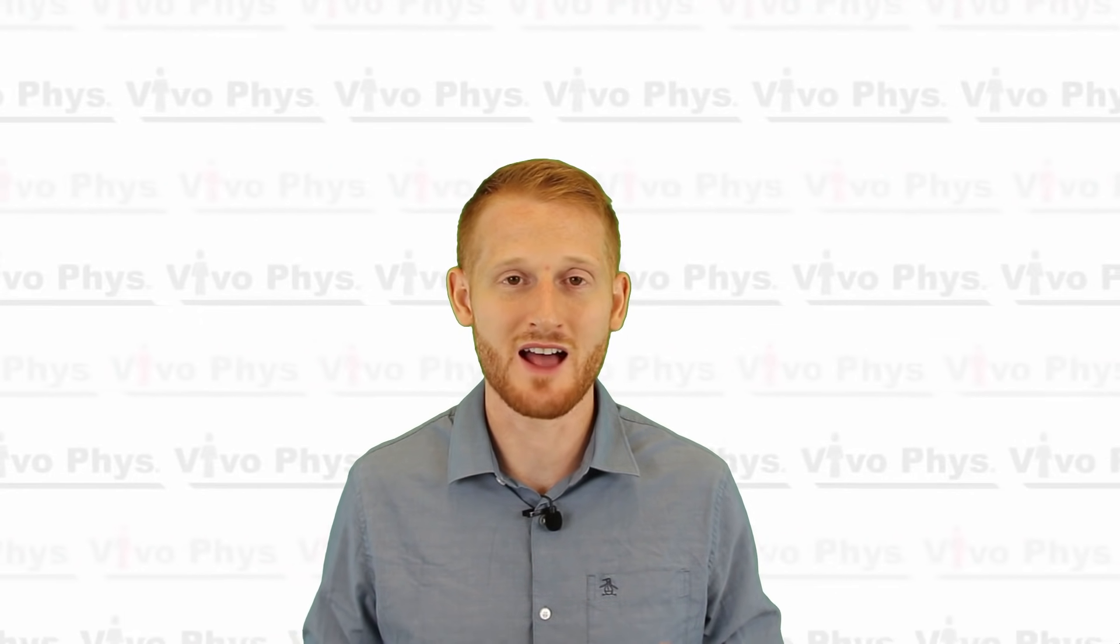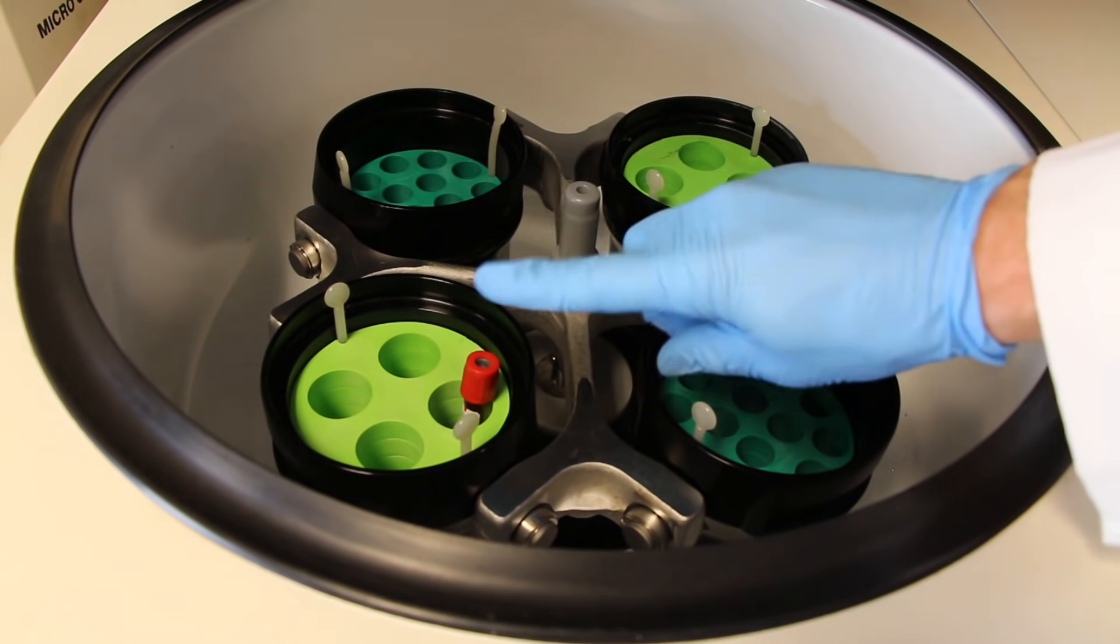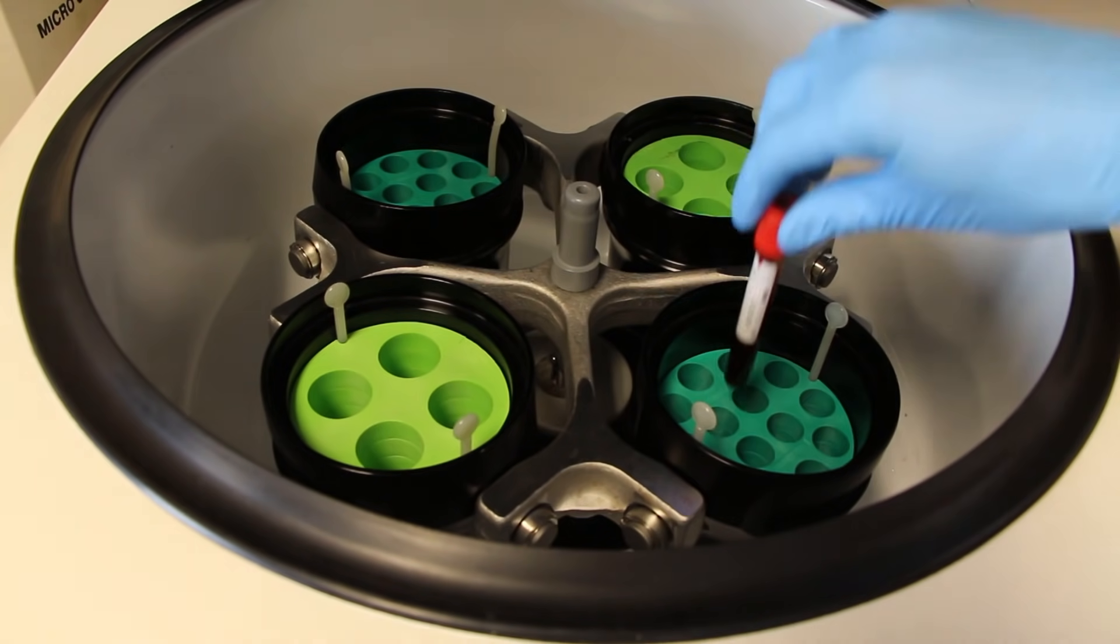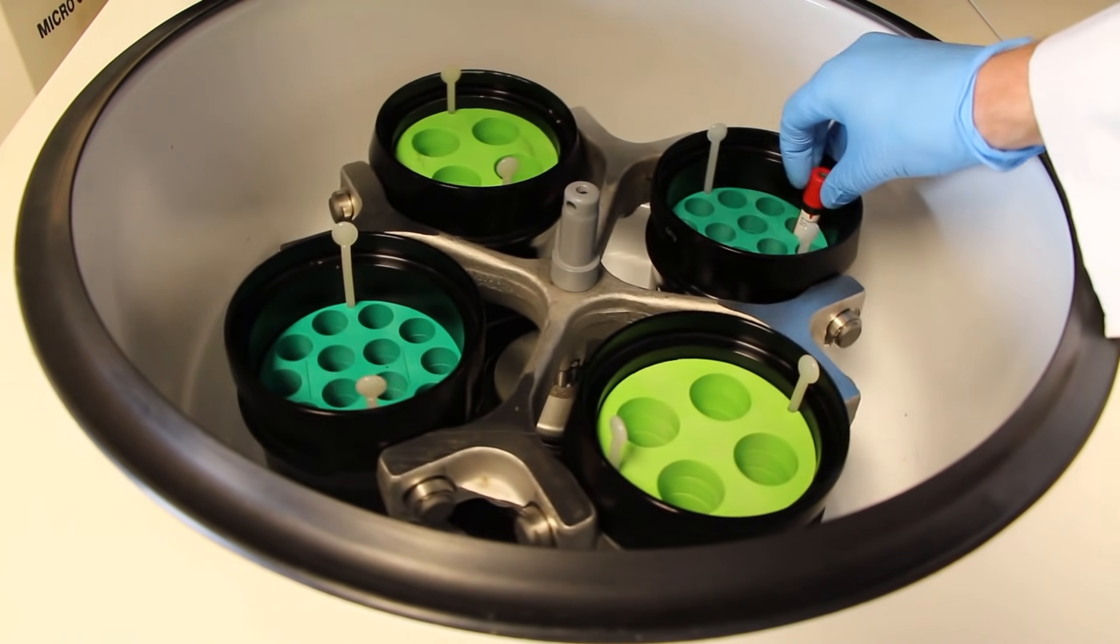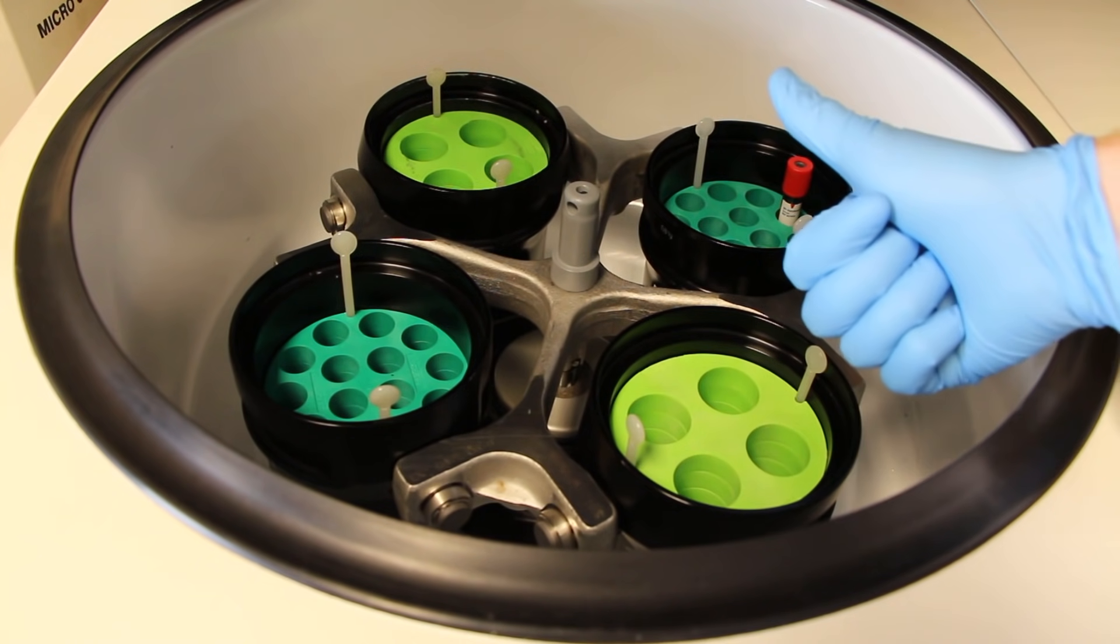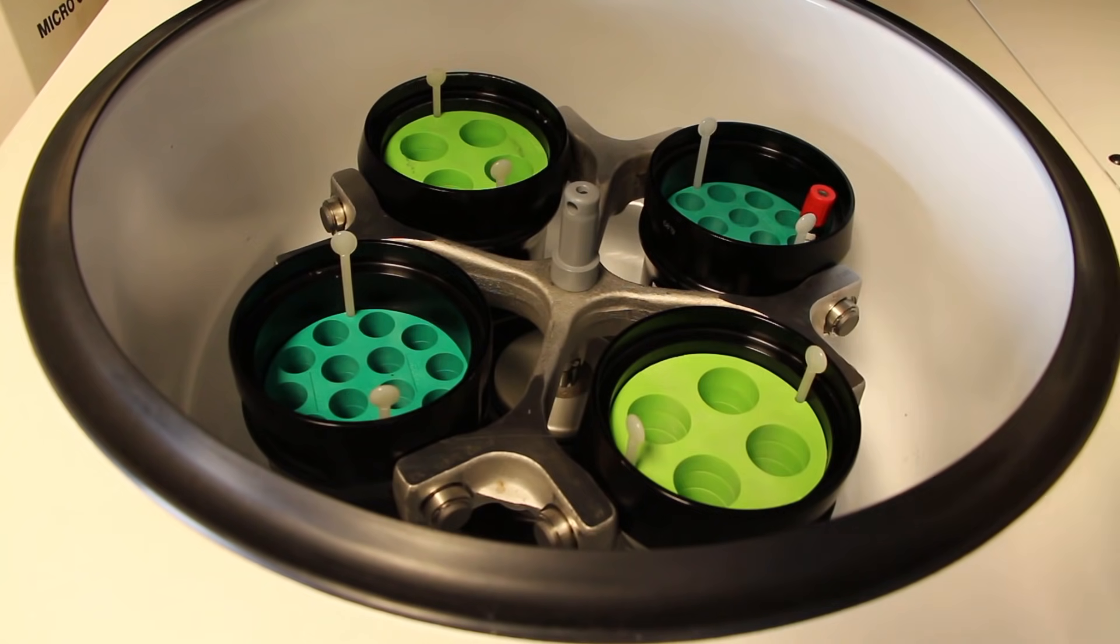Set those parameters to whatever type of analysis you're going to be doing, and then you're going to put the blood tubes inside the centrifuge. Make sure that you're putting it inside the proper tubes within the centrifuge. If you put it in tube holders that are too large for the tubes, it's not going to hold it very well and you don't want that. So put it in the right size tube holders for the tubes you're using.